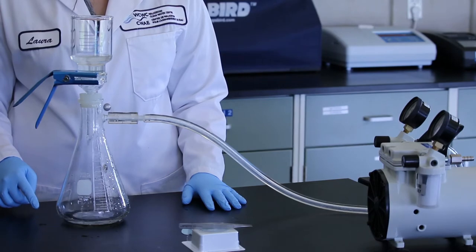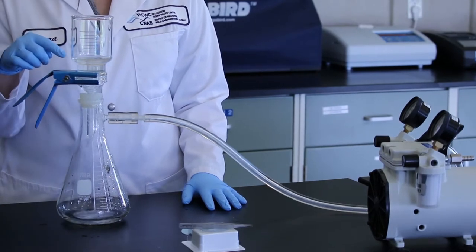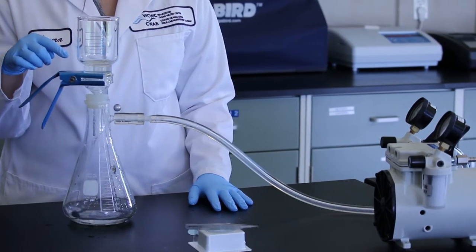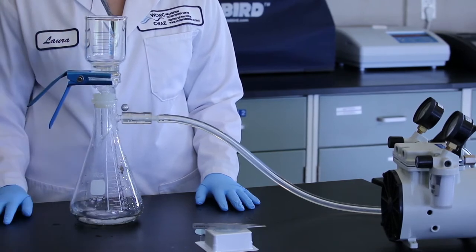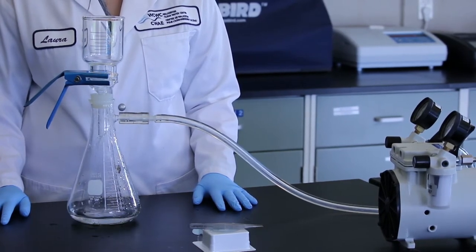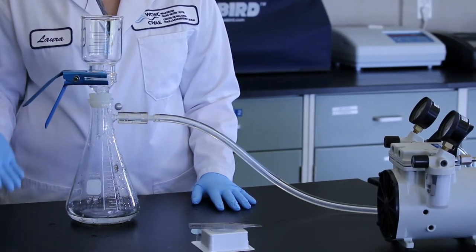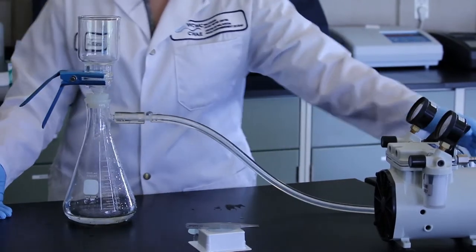The water that passes through the filter is considered dissolved organic carbon, and the particulate that is trapped on the filter paper is the particulate organic carbon. Total organic carbon is the sum of particulate and dissolved organic carbon.